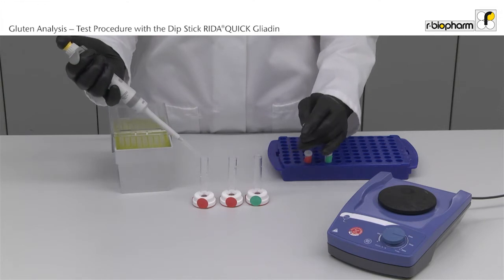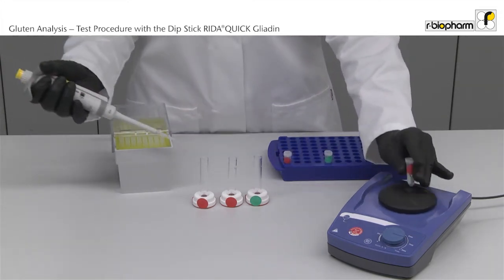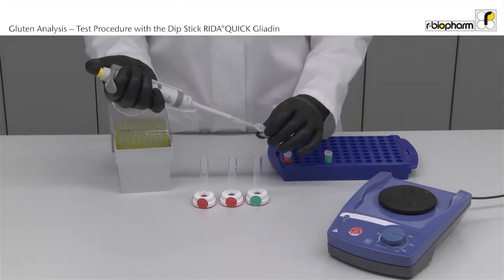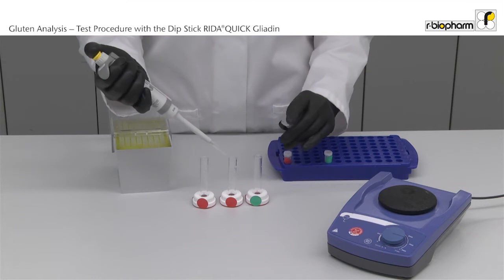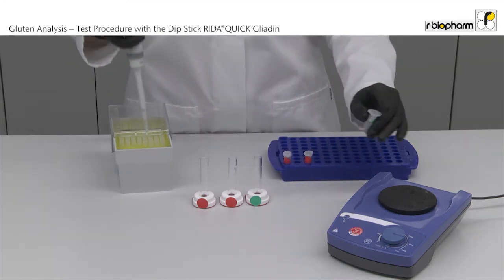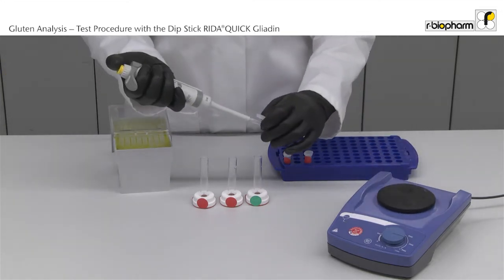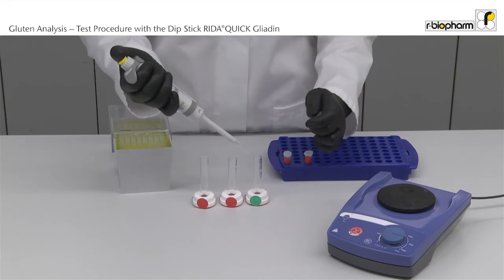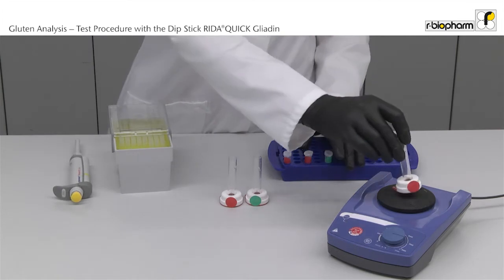The red vials are ethanol extracted samples. The green vial is a cocktail patented extracted sample. Vortex the vials.